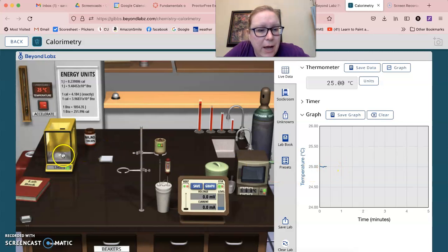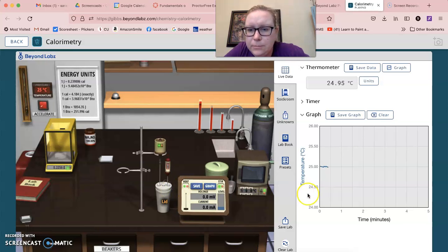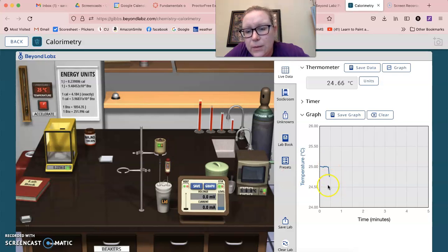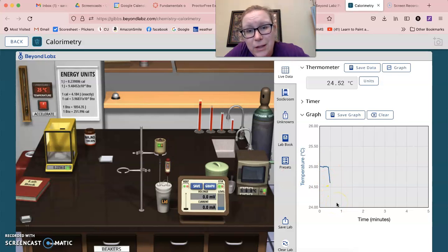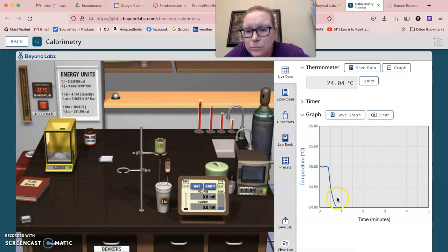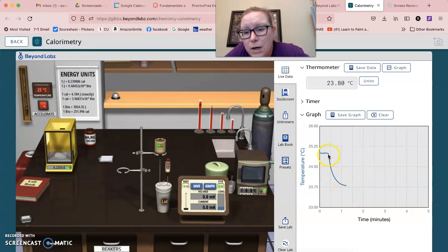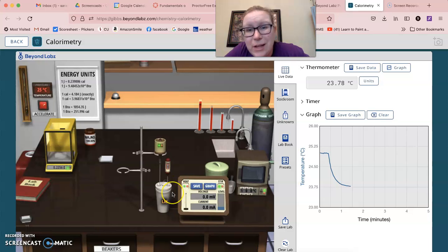Then you're going to drag your ammonium nitrate over here and you're going to drop it in. And then you're going to let it continue to stir, and then you should see the temperature drop pretty quickly. You can accelerate that by clicking over here, right? And so then we can see the drop that you're looking for as this goes.